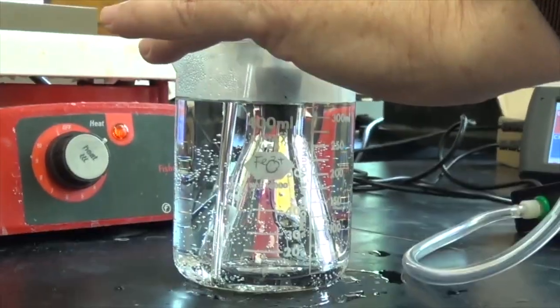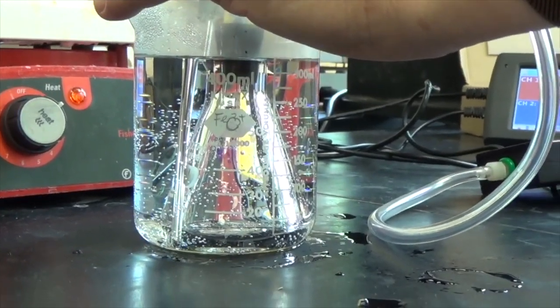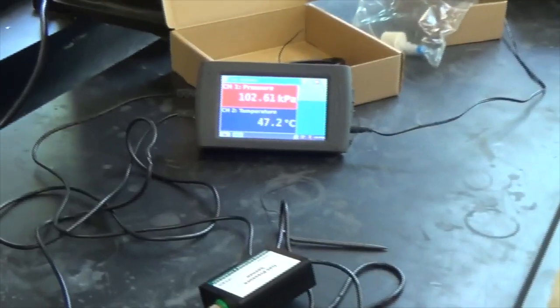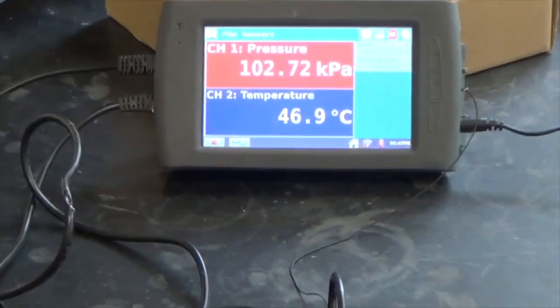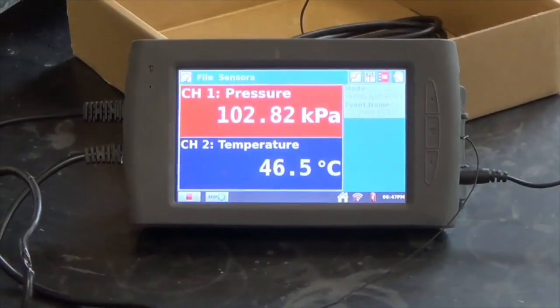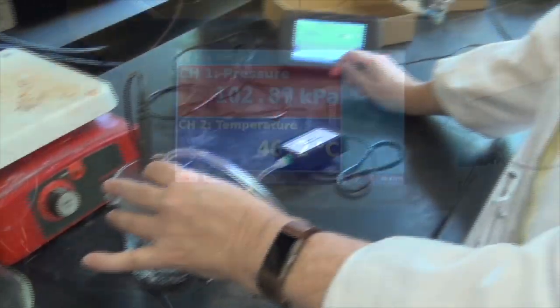Repeat this process again for your hot water as well as your cold water. I prefer to do the ice first and then go into the hot water. When you do this allow again for at least one minute for the air inside to equilibrate to the temperature of the outside of the flask.